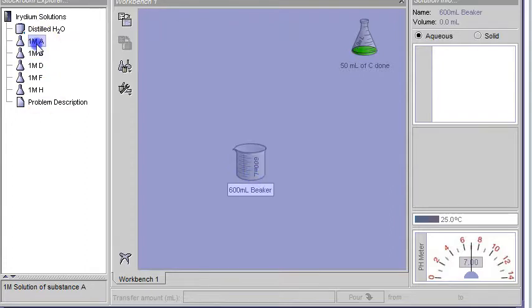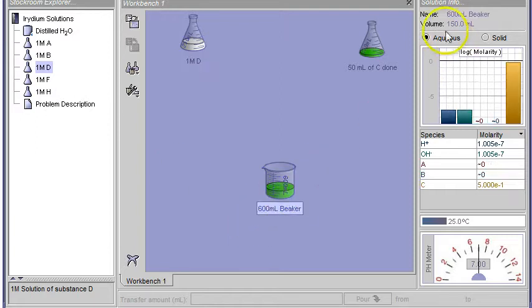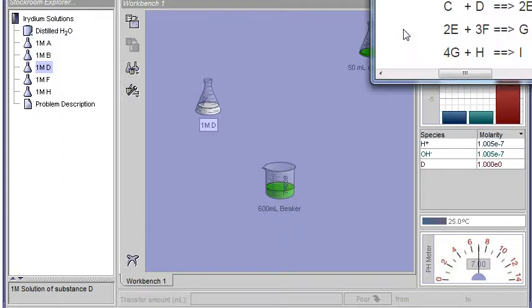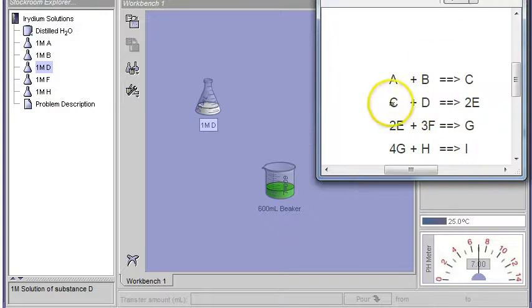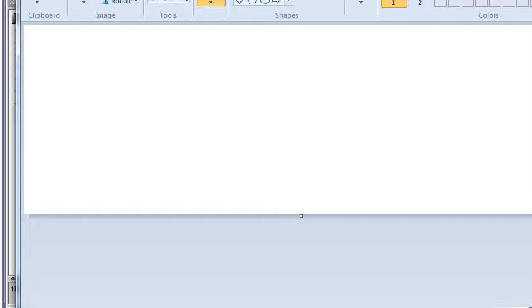Get my beaker. So here I've gotten back my 150 milliliters of C, and I'm making E, right? So I'm going to add some D in here. Now how much D do I add? Let's calculate it this time. Let's do it a little more carefully. You get 1 C and 1 D to make 2 E's. Now these numbers, 2 and the unstated 1 and the unstated 1, are moles or molecules or numbers of things. Whereas what I'm working with in the lab are volumes. So I just need to do some calculation.